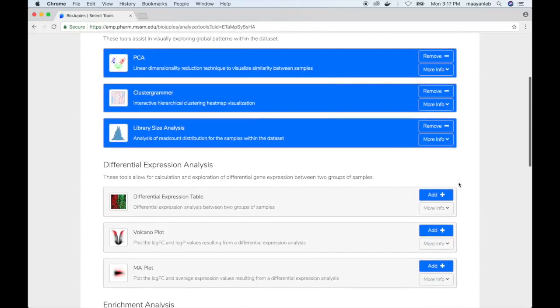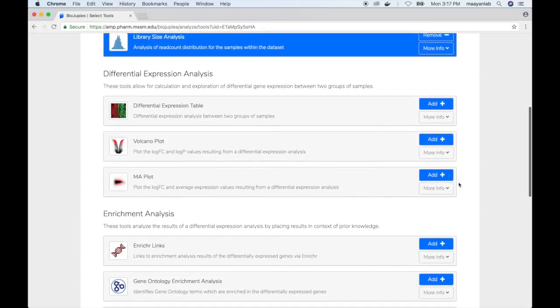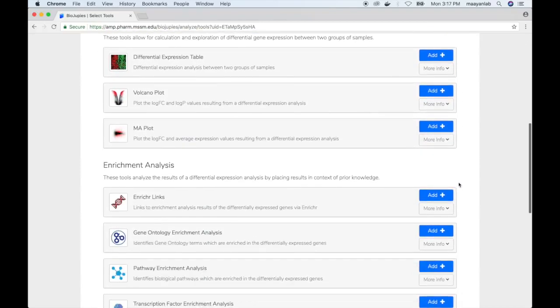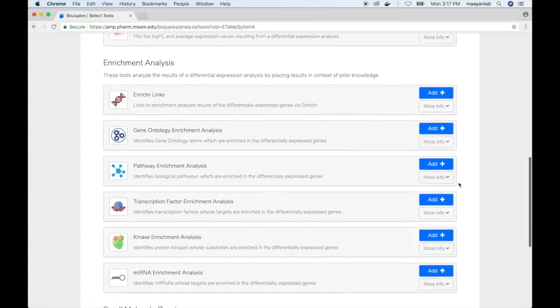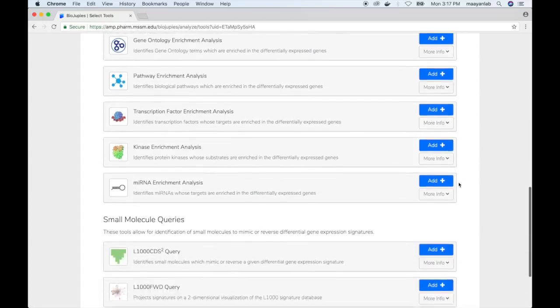Exploratory data analysis, differential expression analysis, enrichment analysis, and small molecule queries.